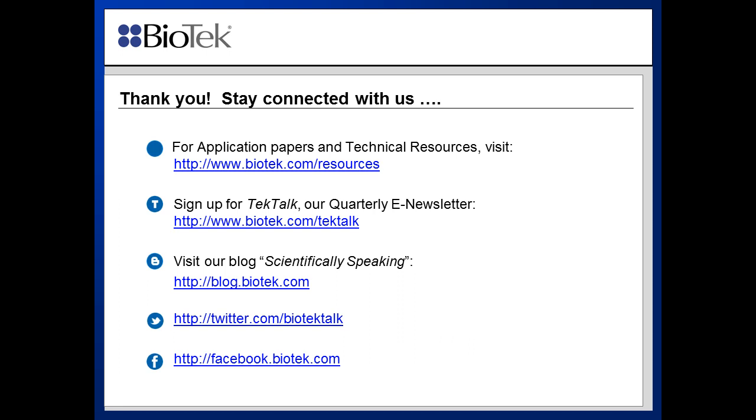There was a question on whether or not oxygen transfer through the plate affects sensitivity. And yes, it does. I was trying to make that point, but maybe not clear enough on that slide. So what we're measuring is oxygen depletion happening in the well, and we need a level of oxygen consumption that exceeds the level of back diffusion through the plastic. So that's why we would typically recommend using fully confluent monolayers to maximize the response from the cell. So the probe will detect any change in oxygen that happens, but the consumption must exceed back diffusion for that change to happen.